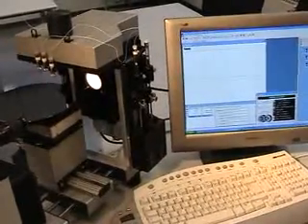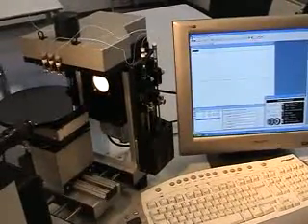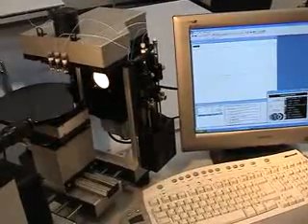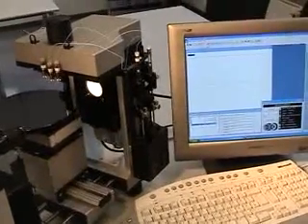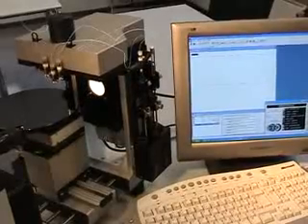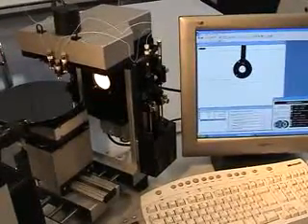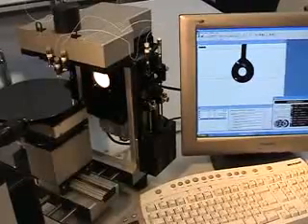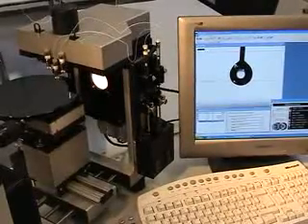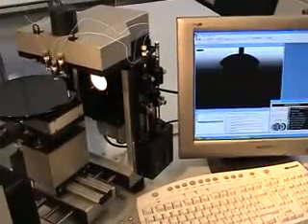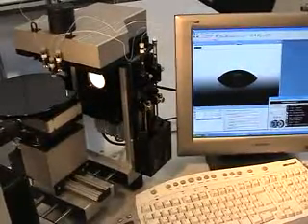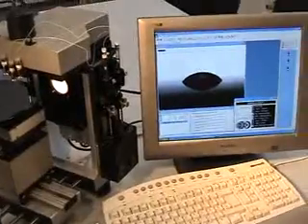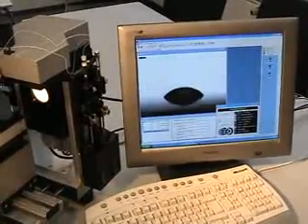Typically a measurement will take between 5 and 10 seconds, depending of course also on the dosing volume, the dosing rate, the distance between the two points, and we can also set some waiting time between the dosing and the performance of the measurement.